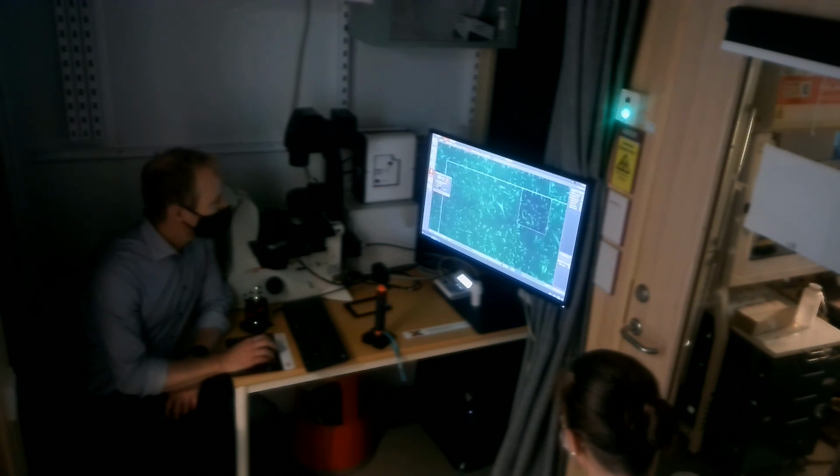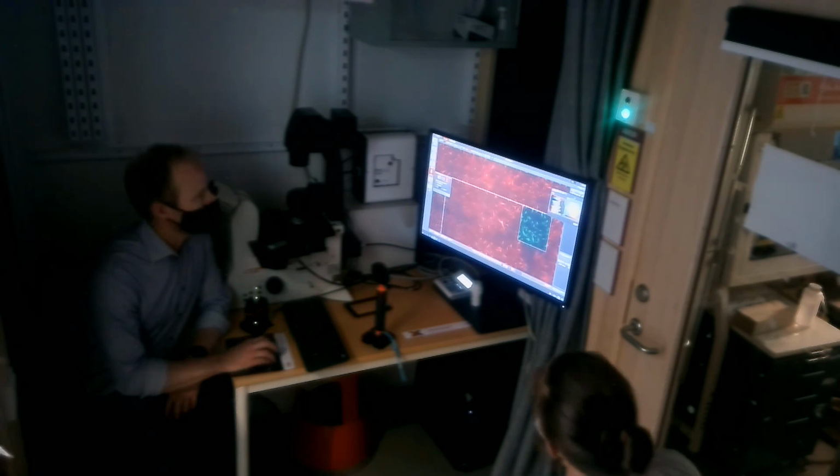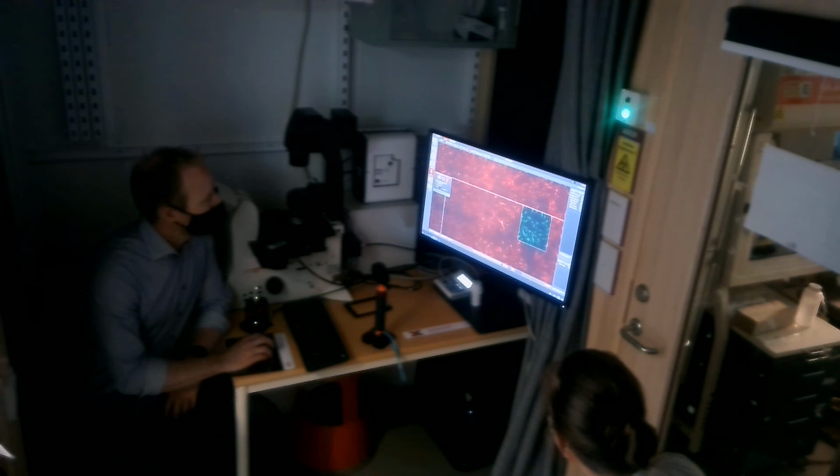Let me see if I can illustrate this. It's a bad color. I don't know if you can see the difference between this color and this color. This is green, and the background here is unfortunately green. Let me see if I can change it. I don't know if you can see it better. It's very thin, this line now, but this is green and this is white, and then this is green again.